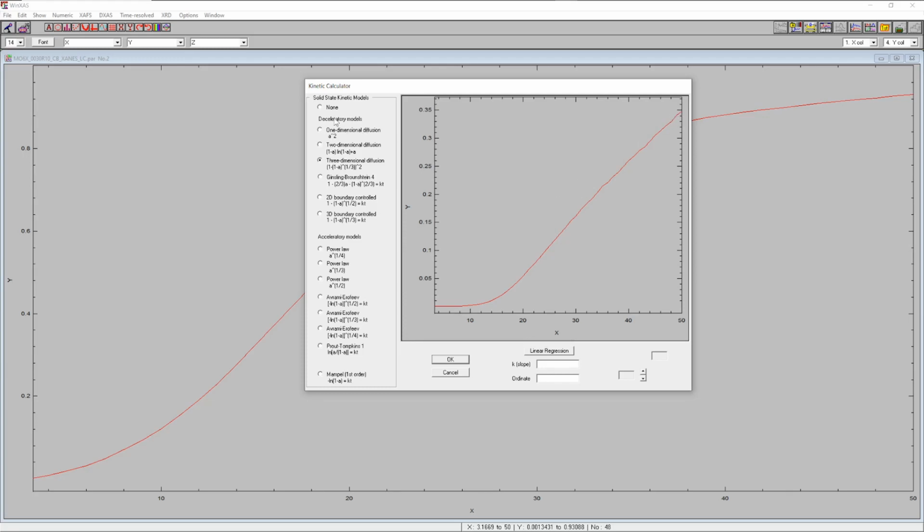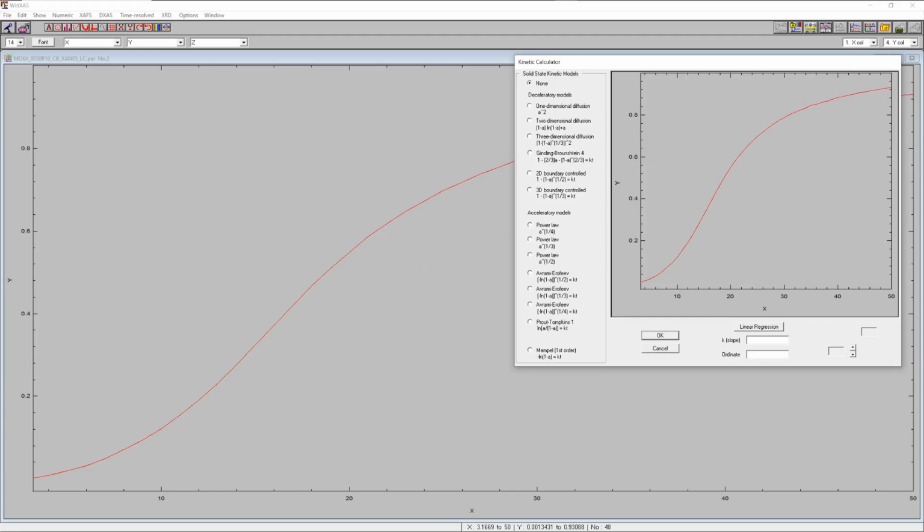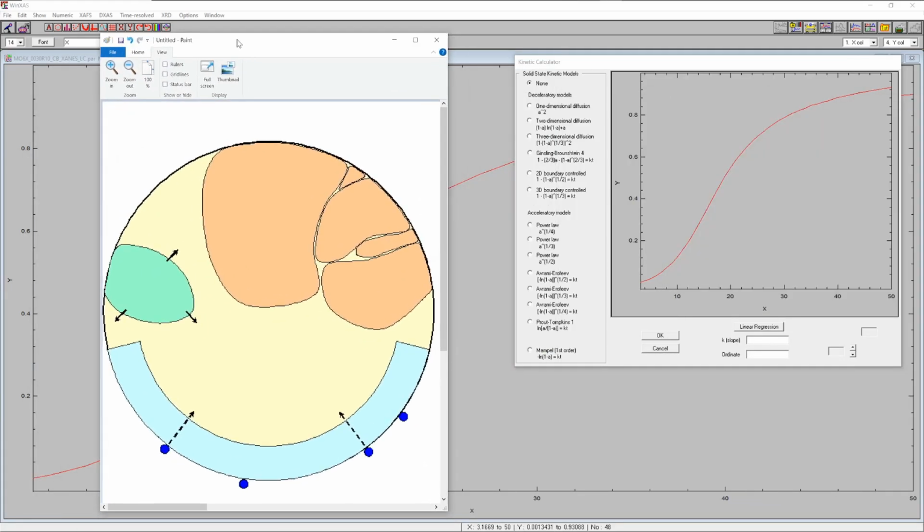Basically, and this is just schematically depicted here, what we are seeing when we start the reduction of molybdenum trioxide is nucleation and growth kinetics, so formation of nuclei. There's an increase in the interface between molybdenum trioxide and dioxide, and the larger the interface, the larger the reaction rate, up to a point where those nuclei overlap, and we see a decrease in reaction rate. This is the regular nucleation and growth kinetics.